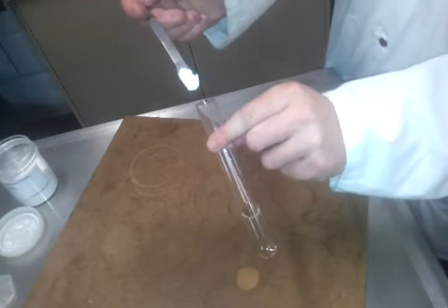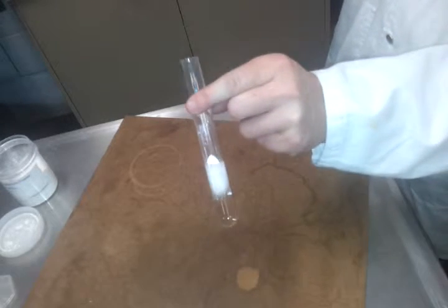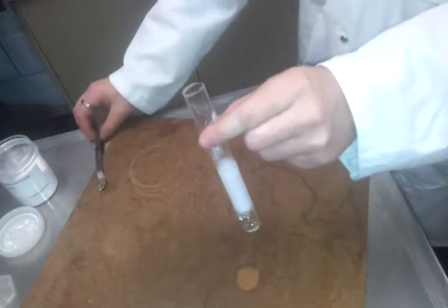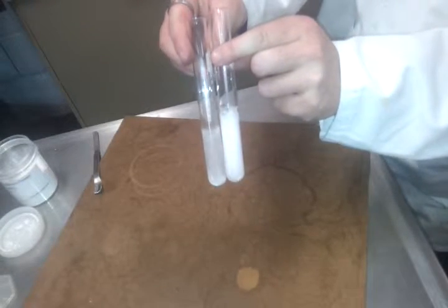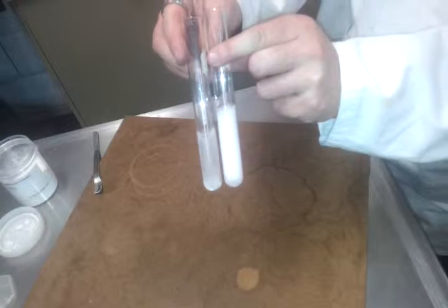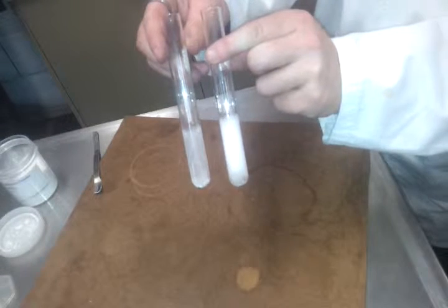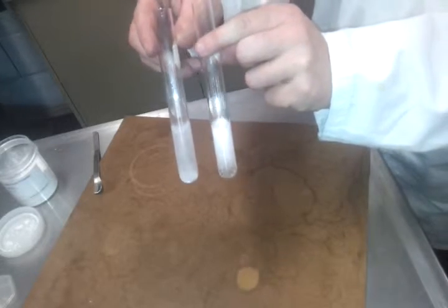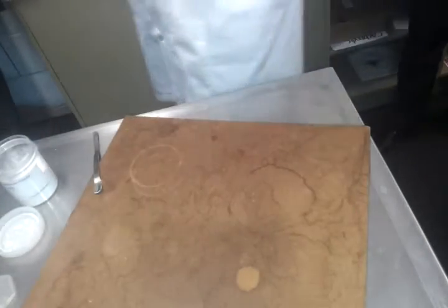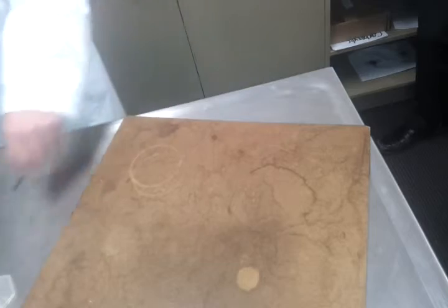I'm just going to stand back a little bit on this one just in case, and we can see that it's going a lot faster. So if I put the two next to each other, there's a real reaction difference, even though I've used about the same mass and about the same volume, and the two acids with the same concentration. Alright, so we want to know the reasons for that, and this is a thing called the collision theory. So I'll just quickly go through what that is up on the board for you.